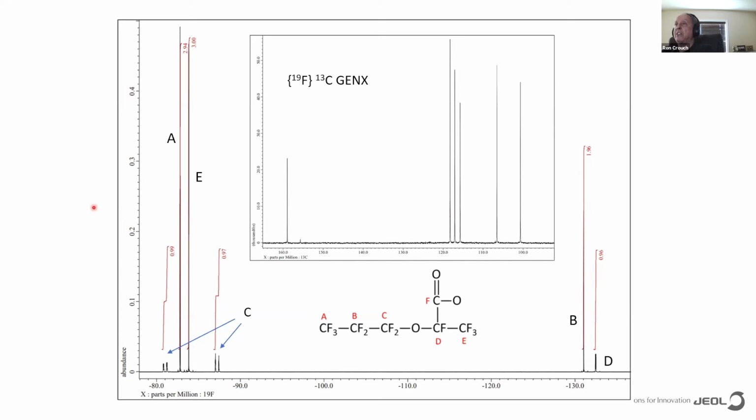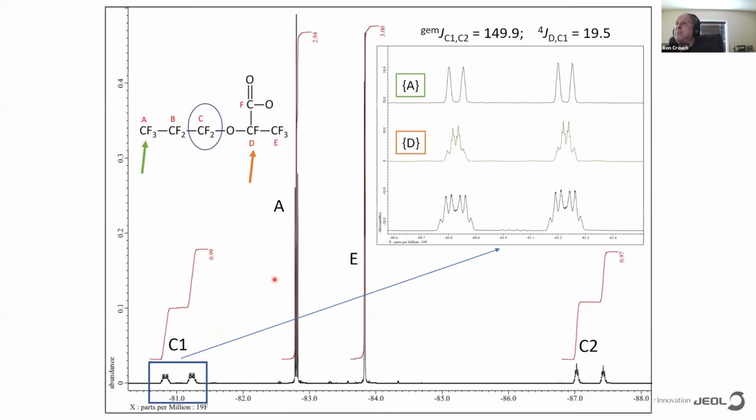And we say, gee, this is kind of nice. We can expand this fluorine spectrum and then we can look at it and say, oh, wow, we have a nice triplet here. It must be this guy right here. And then, well, what's with this guy here that's a singlet, more or less? It's really like a 1.8 Hertz J. This methylene circled in C is an AB quartet.